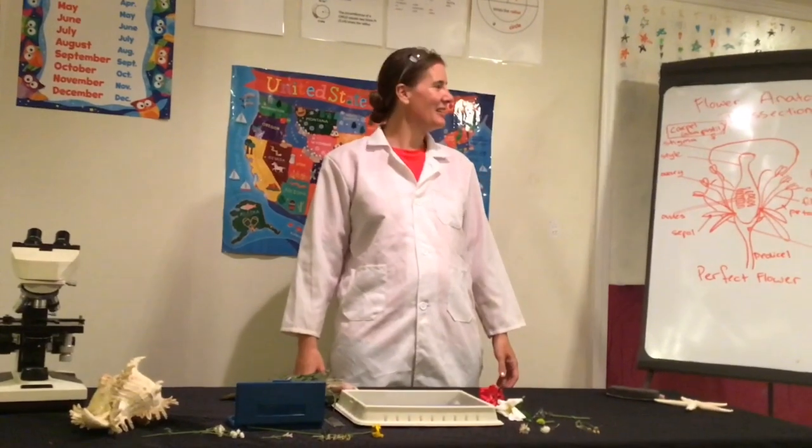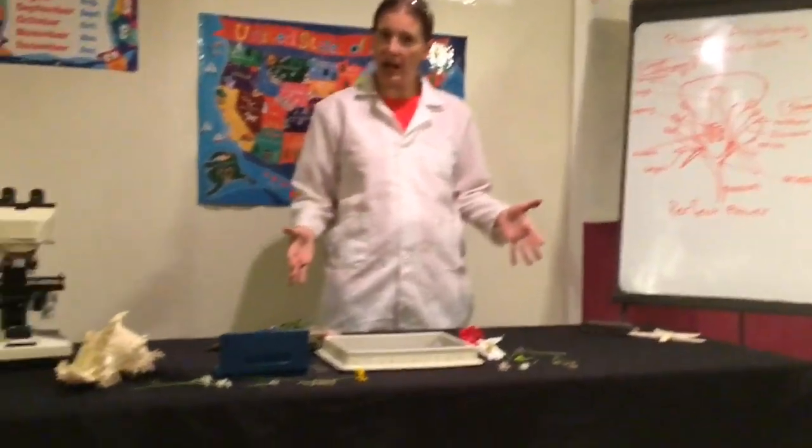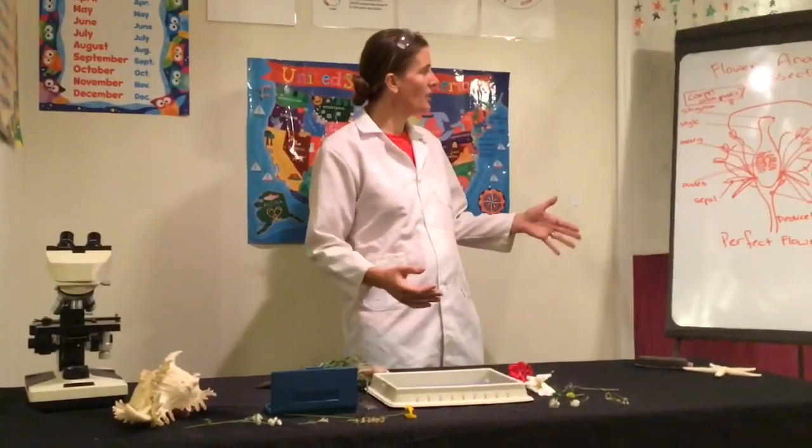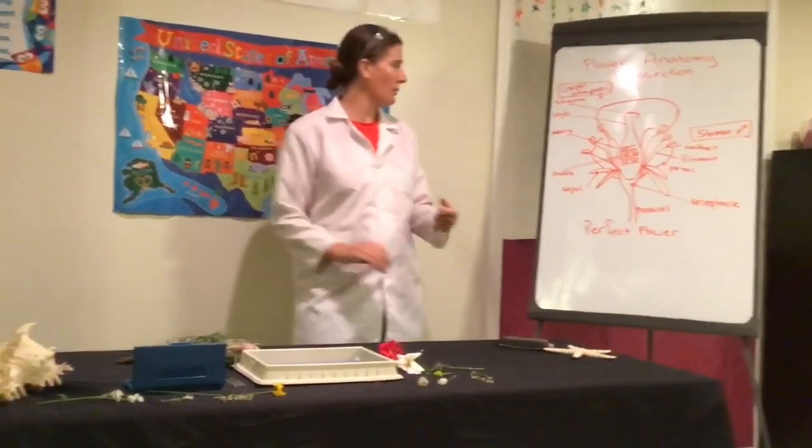Hello again. Today we're going to look at a lab that involves the anatomy of a flower. So I've collected some samples of flowers from around my neighborhood, and we're going to see if we can identify these different parts of a flower in our samples.